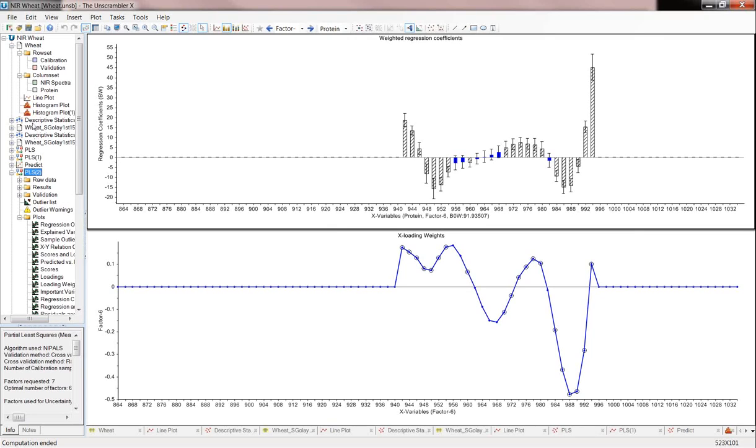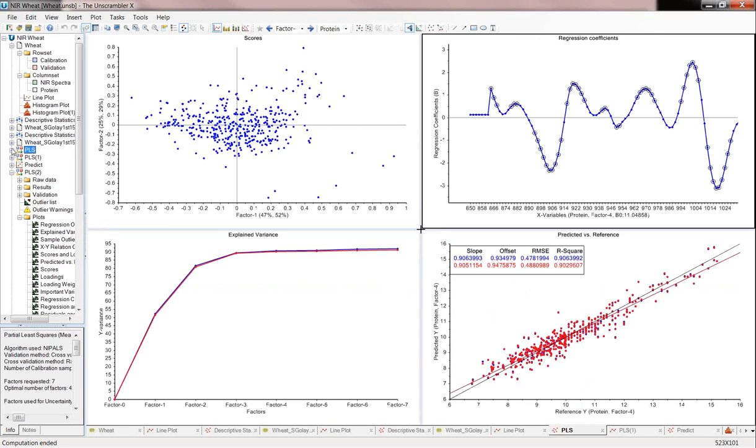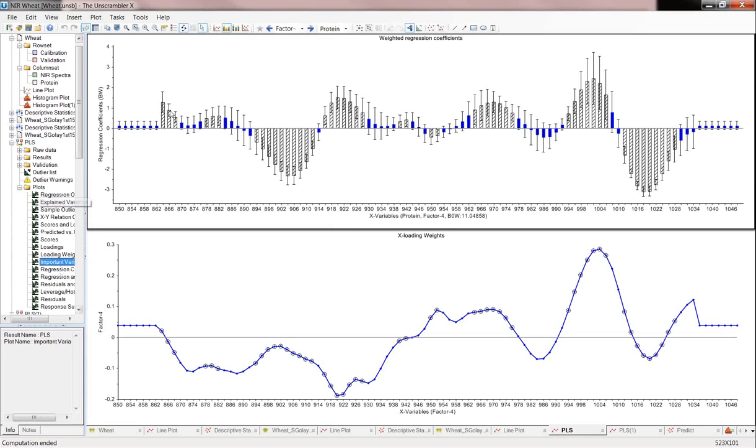Sorry, guys, I'm in the wrong one again. It looks at each variable and how it's changing in comparison with your Y value and what that variation is. In this case, these samples are changing significantly with our Y variable, but the variation there stays on one side of 0.